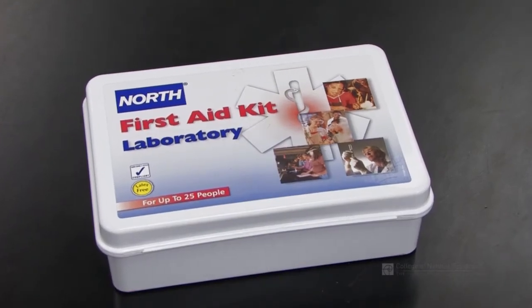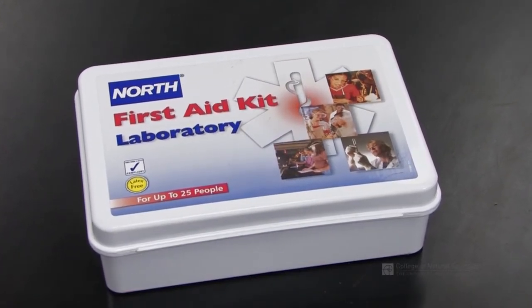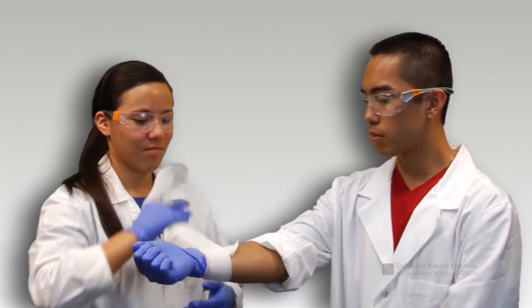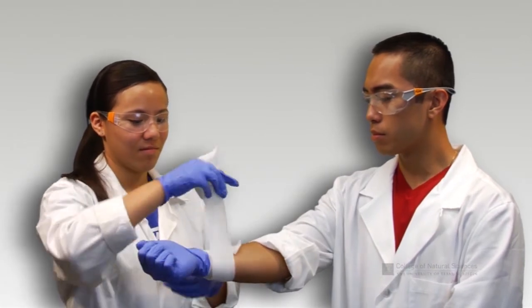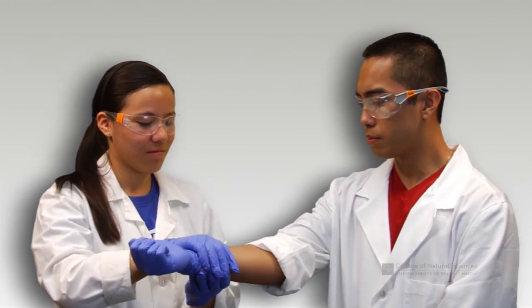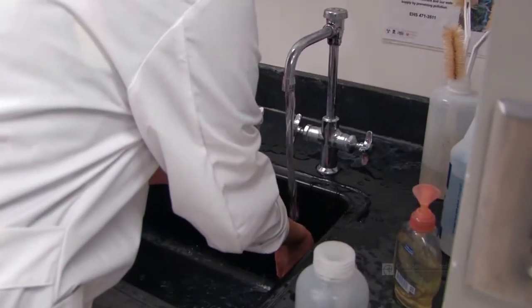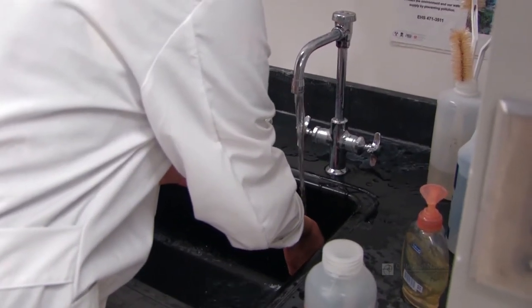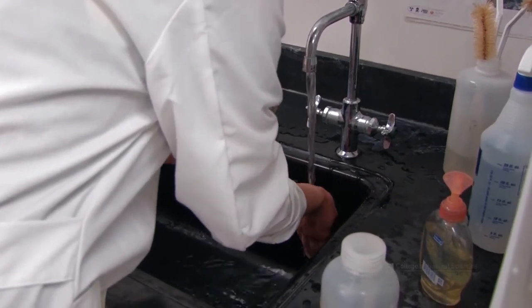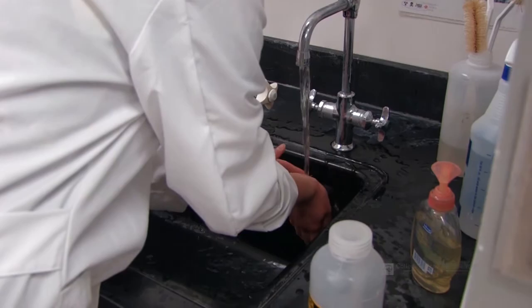Minor cuts in the lab can be treated with equipment found in the first aid kit. If someone in the lab has received a serious laceration, emergency medical help should be obtained immediately. Try to keep the wound closed and apply pressure. Minor burns from hot plates and other heat sources can be treated by running the burn under cold water. Ice may be applied if available.